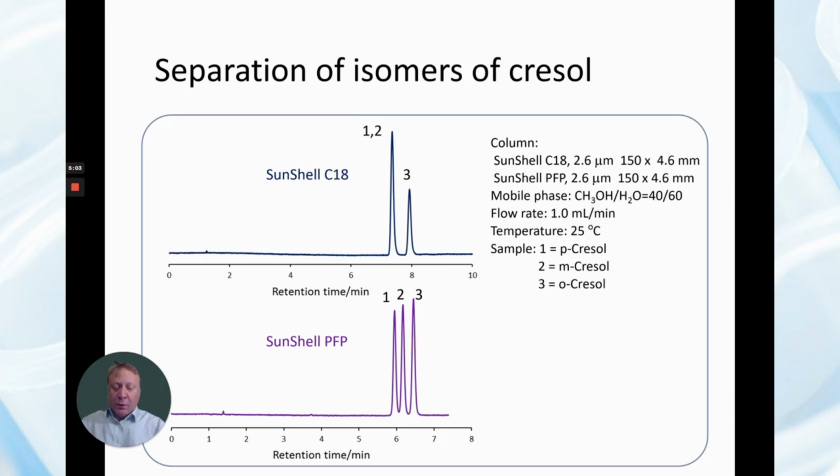cresol quite well. Just as a side note though, if a crown ether is added to the mobile phase, the C18 would be able to separate all three. Again, the para cresol, the meta cresol, and the ortho cresol.